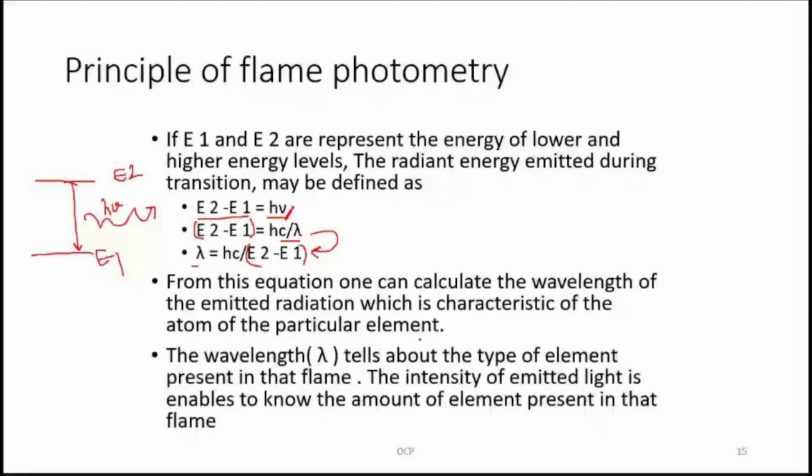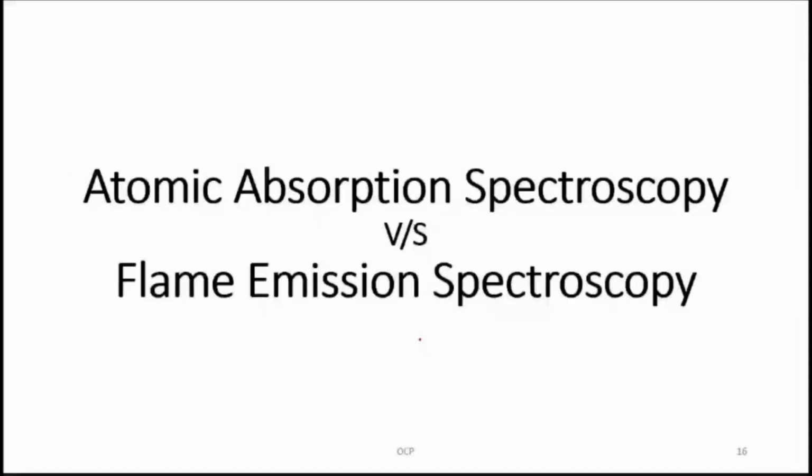Now, let us compare atomic absorption spectroscopy and flame emission spectroscopy.